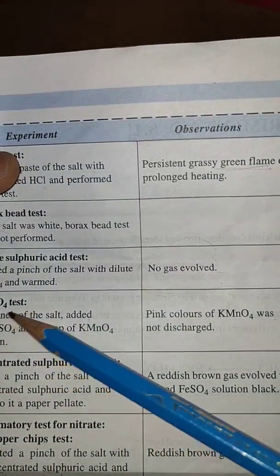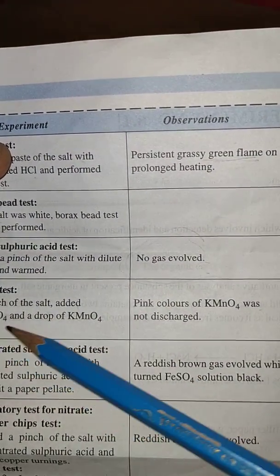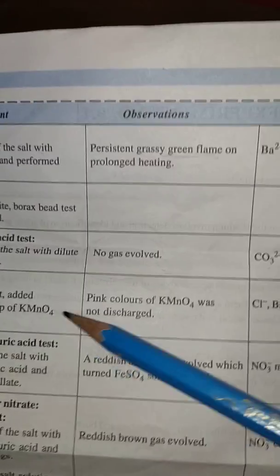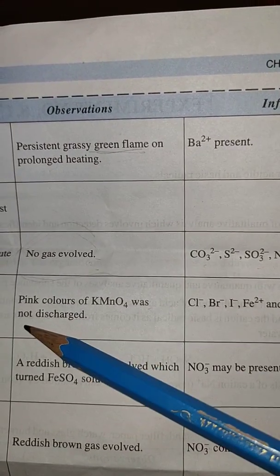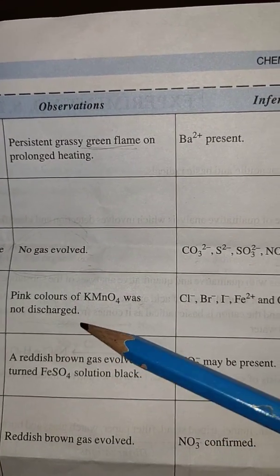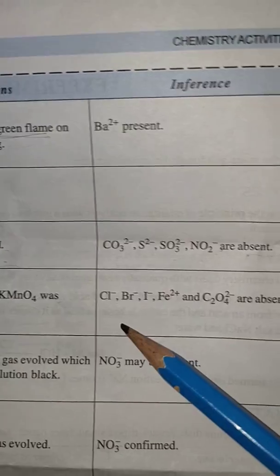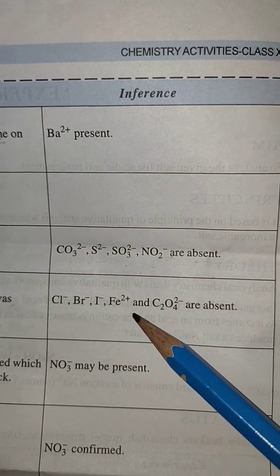Come to the KMnO4 test: take a pinch of the salt, add dilute H2SO4 and a drop of KMnO4 solution. Pink color of KMnO4 was not discharged, so Cl⁻, Br⁻, I⁻, Fe²⁺, and C2O4²⁻ are absent.